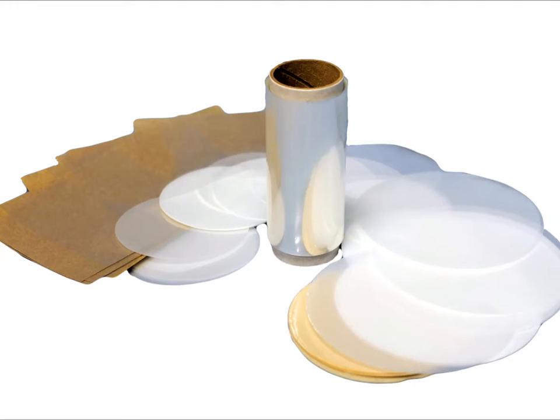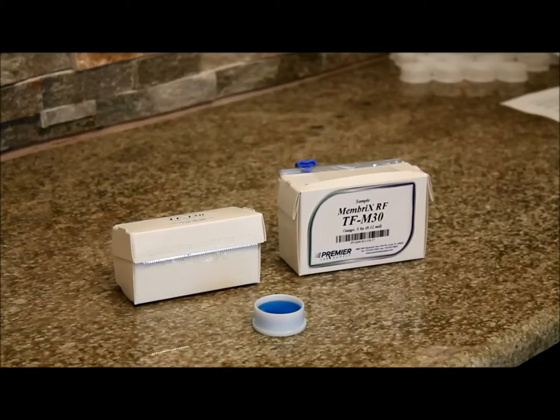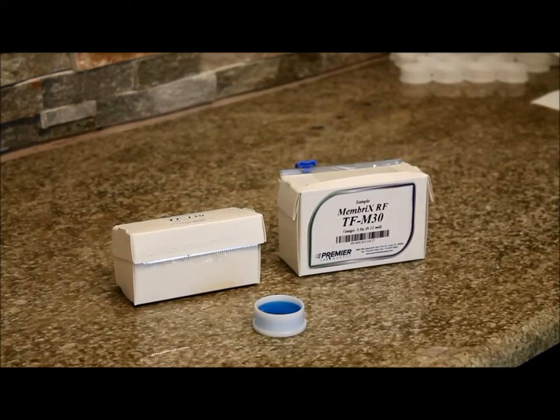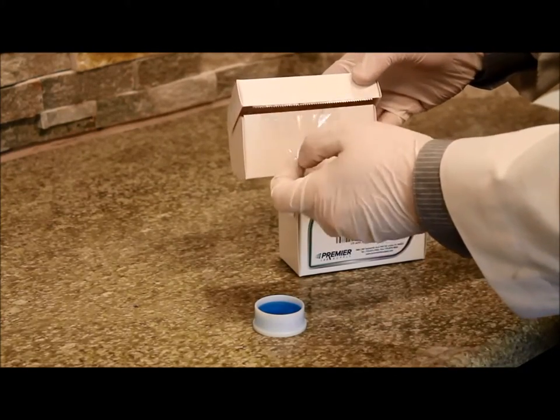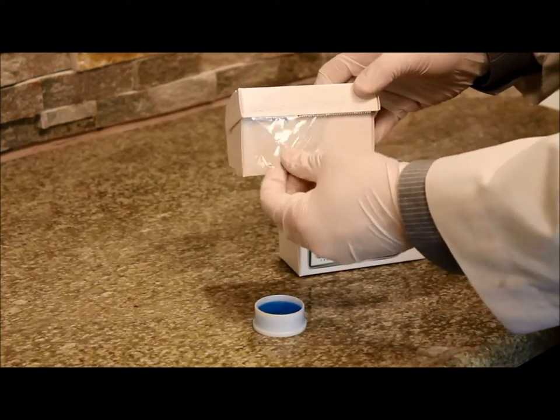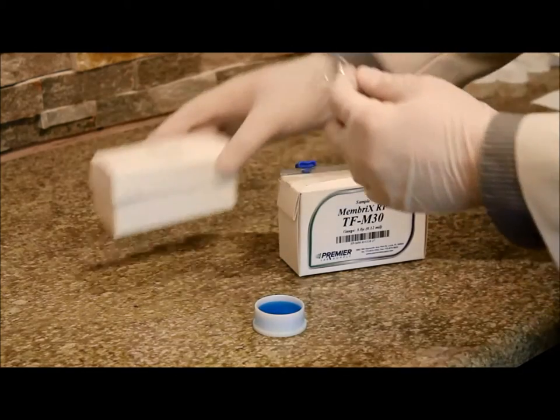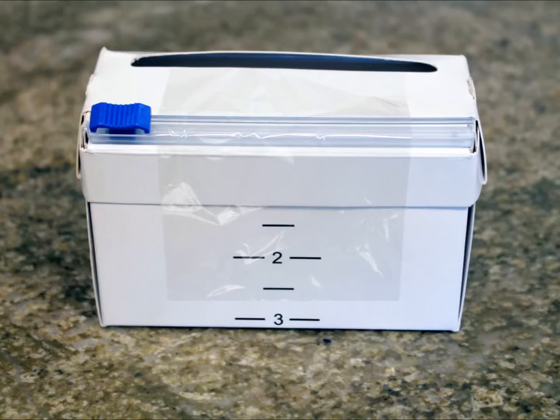Film rules are a popular choice in sample preparation for XRF analysis of liquid samples. Traditional film boxes rely on a serrated edge to cut the film, resulting in jagged film edges and potential leakage from the sample cup.